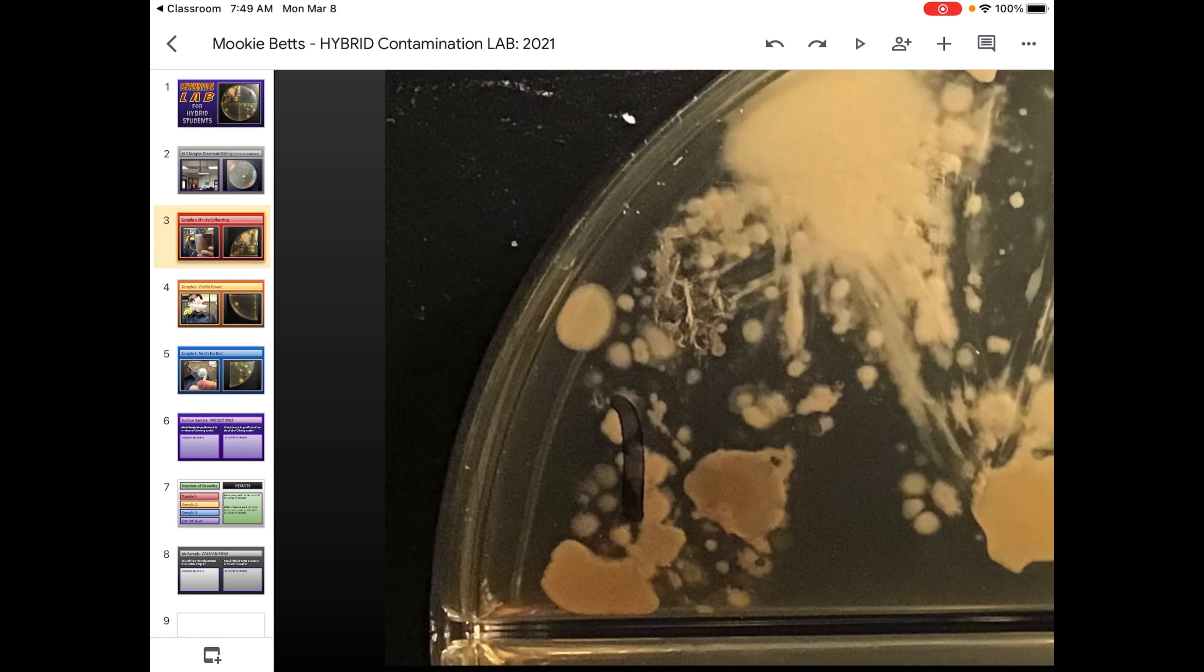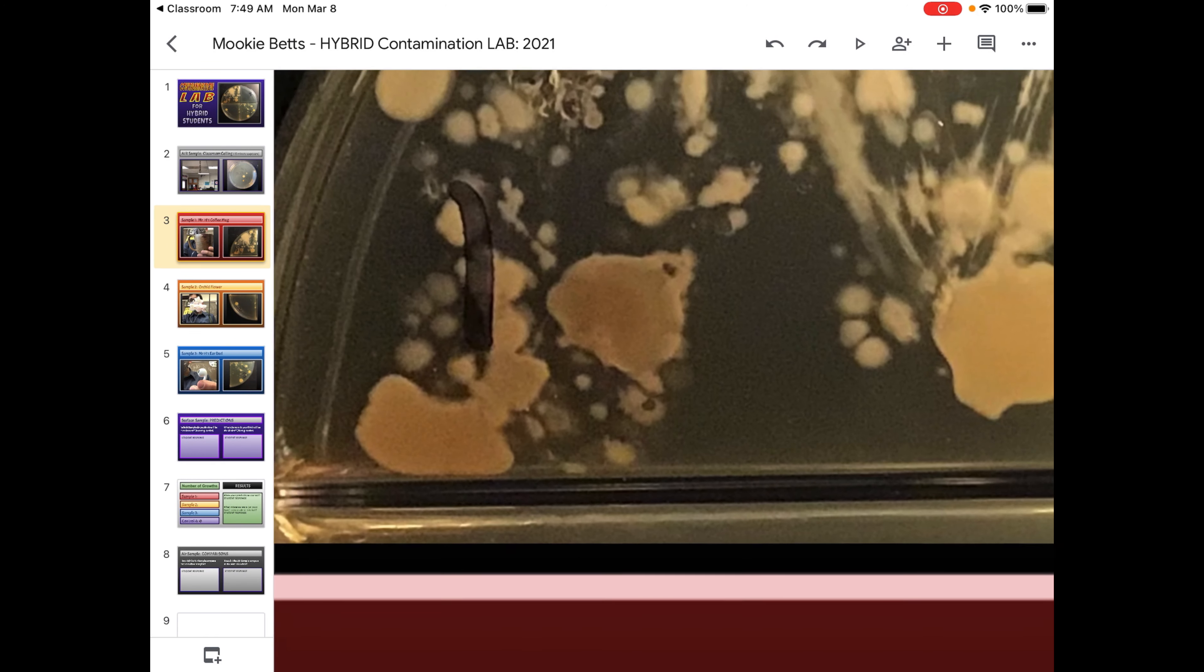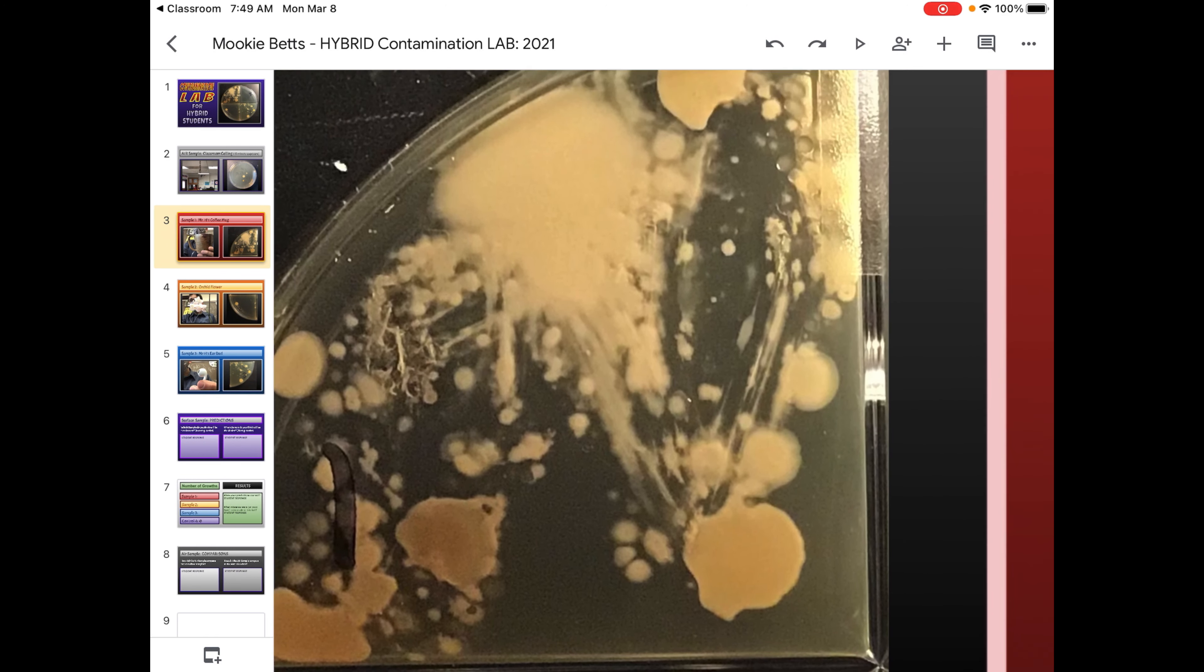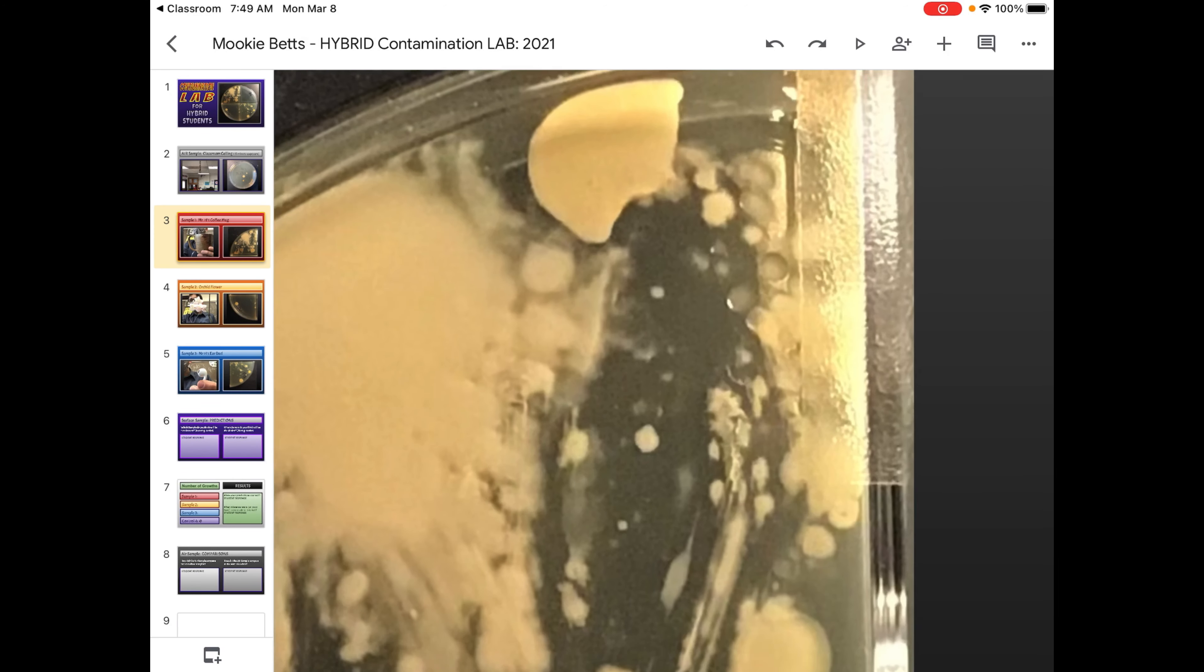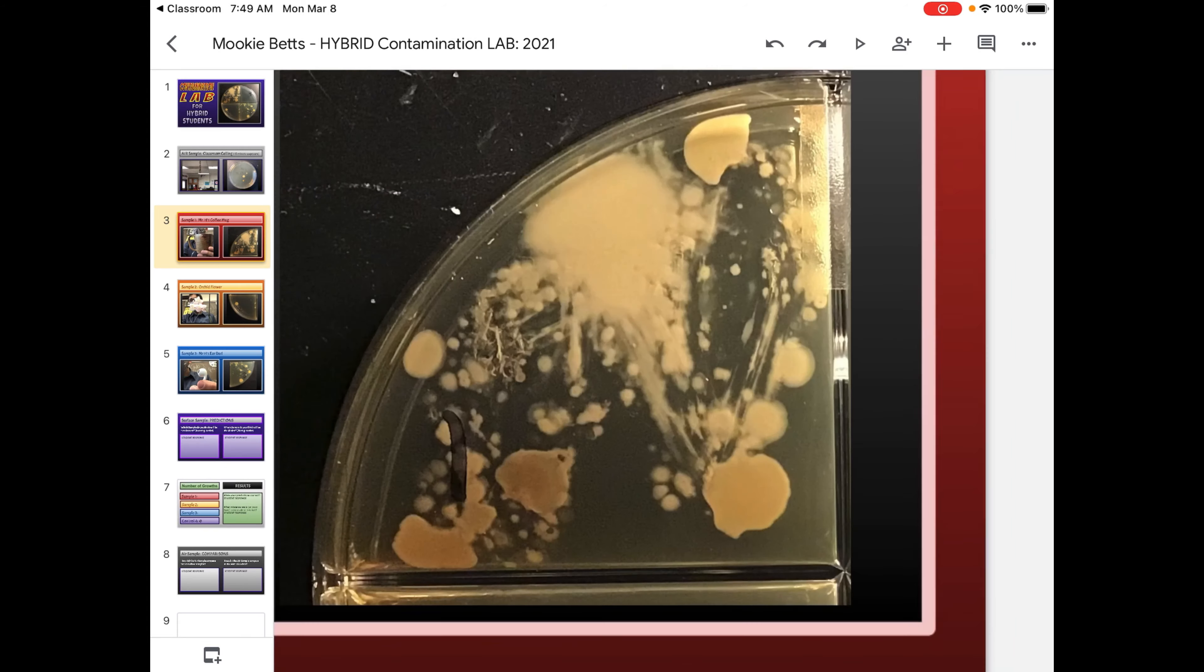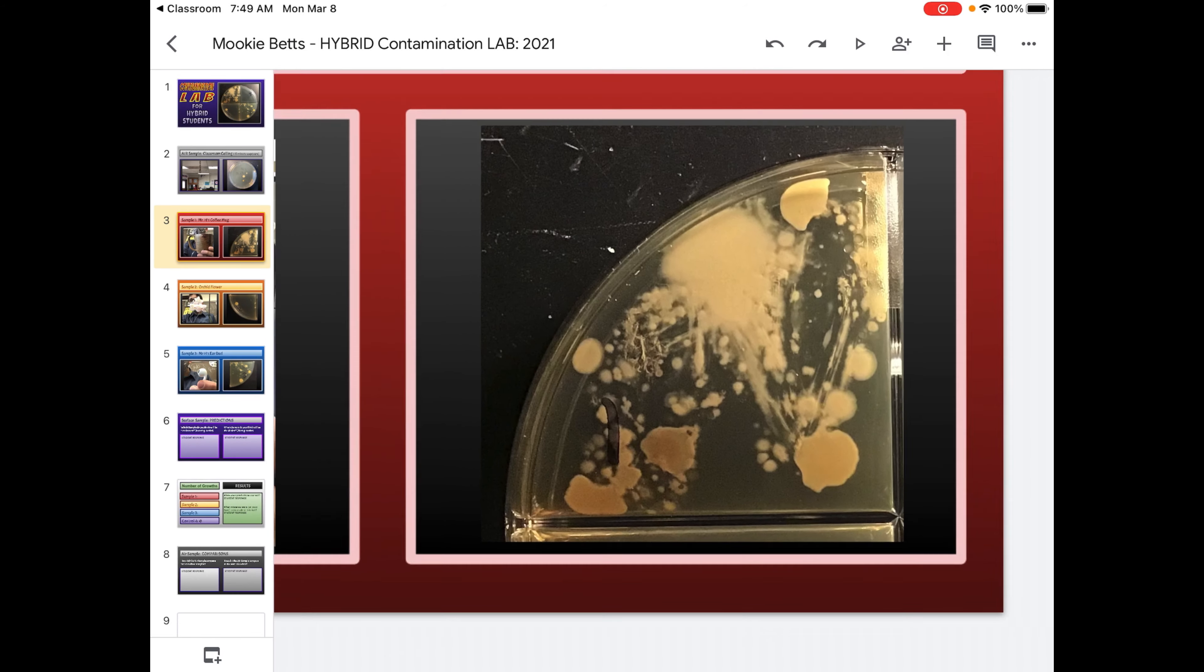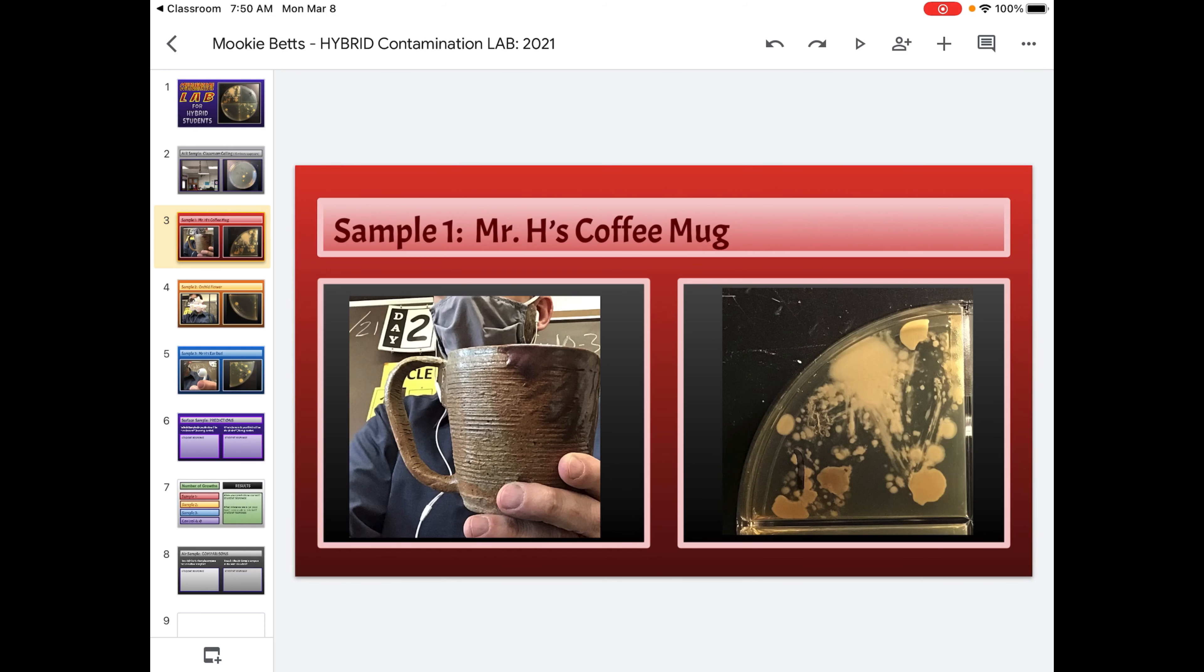But each circle, even these tiny ones, represents a growth. So we need to count how many things grew. Ooh, look at that clear spot between those two. They might have been fighting. So the counting is what takes a while. And this is why being in a group would help. Now hybrids at home, you weren't in a group, but I did all the pictures and stuff for you. So part of the lab is easier because of me. So do your best.